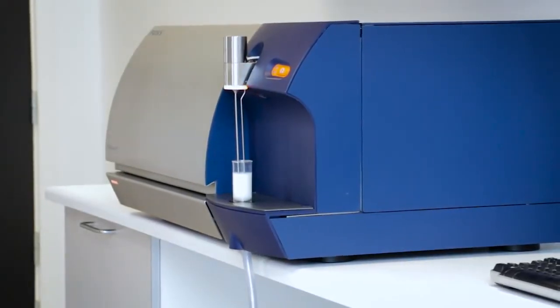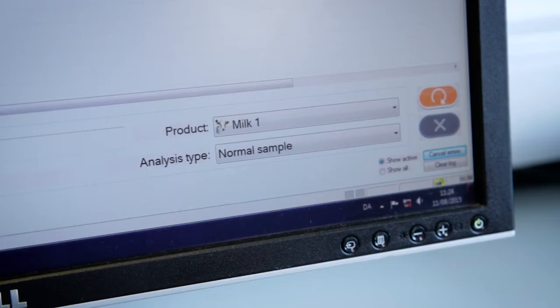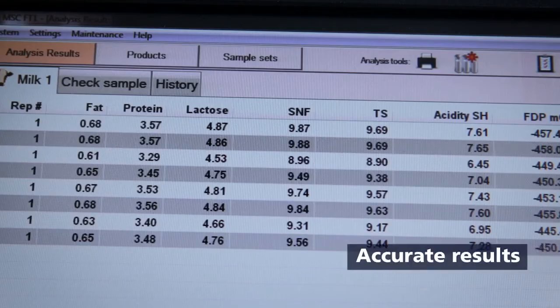The FOSS patented standardization liquid eliminates time-consuming and costly slope and intercept adjustments and always ensures accurate results.